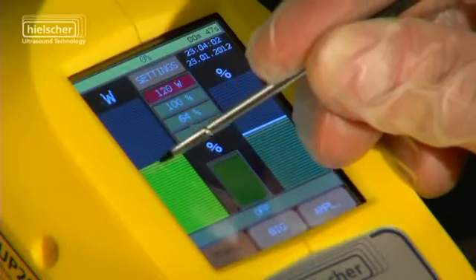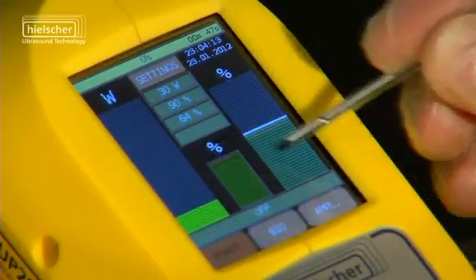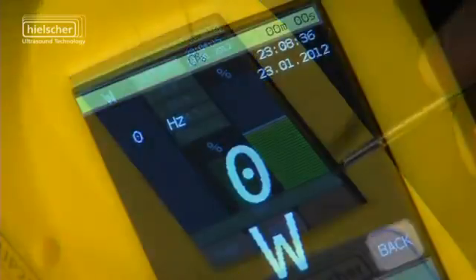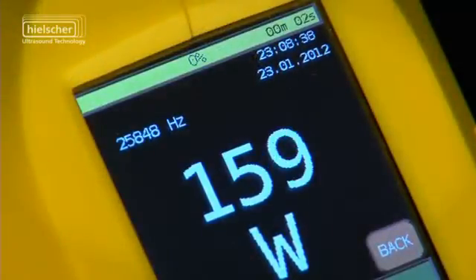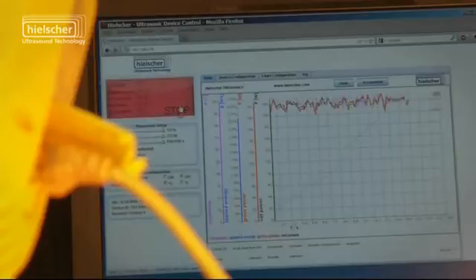By means of its color touchscreen and the intuitive control panel, all process parameters can be accurately controlled, displayed and recorded. The process and measurement data generated are automatically sent and stored on the integrated SD or USB card.